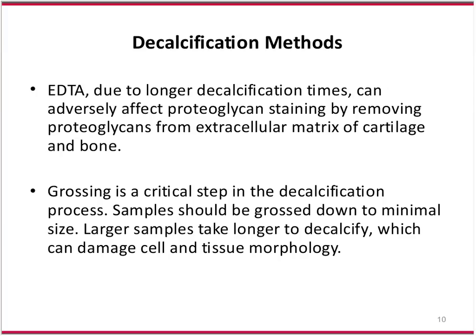So grossing is a critical step in the decalcifying process. Samples should be grossed down to the minimal size. Larger samples take longer to decalcify, obviously, which can damage cell and tissue morphology.